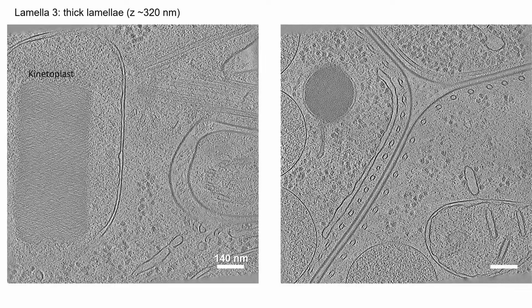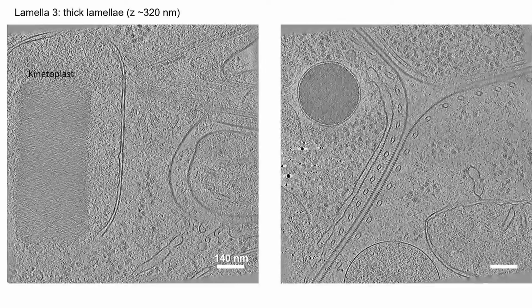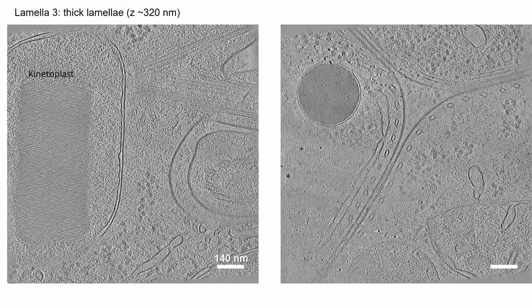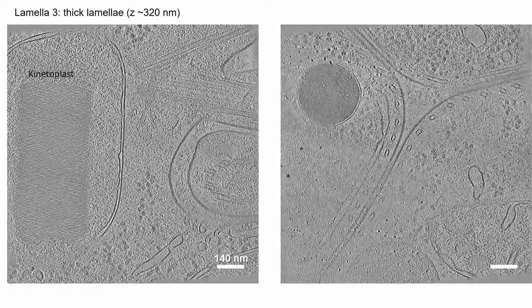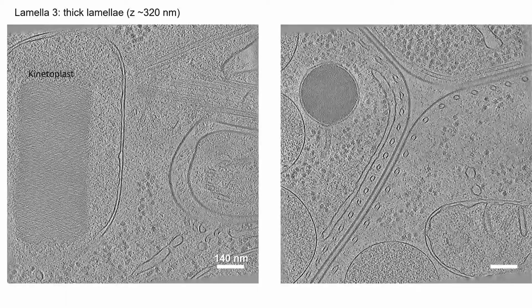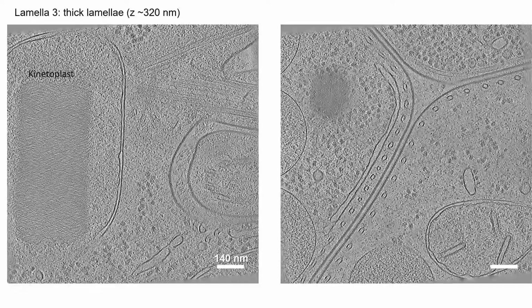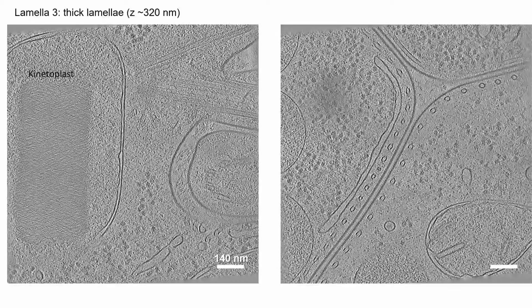And this is another one where we can see the subpellicular microtubules. We can define each one of the protofilaments in this tomogram, and also the mitochondria and all the cristae and some densities in the membranes of these cristae.